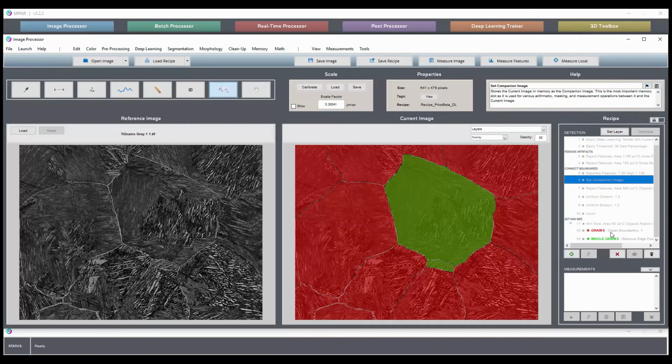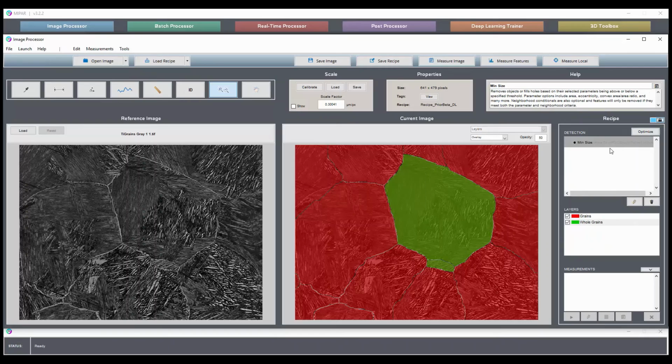And now with steps set as layers, when the recipe loads, you'll see it in this view initially, simple mode, where you'll just see the layer names and colors and key settings that have been exposed to the end user if you'd like them to be, where they have easy control over variables like min allowable grain size.